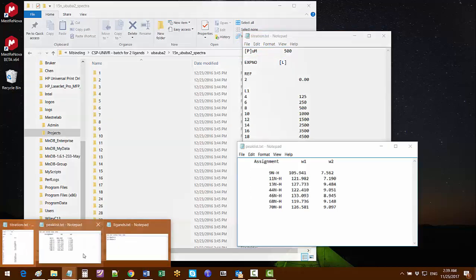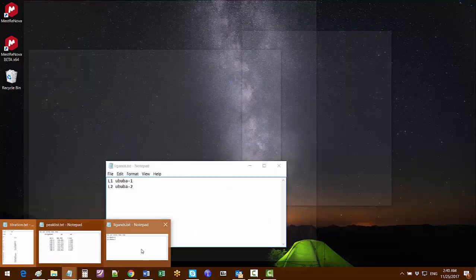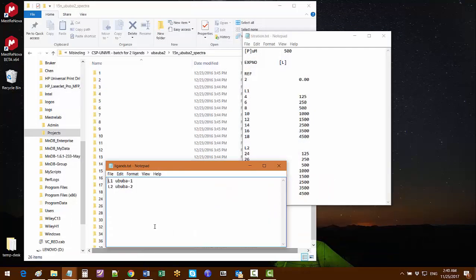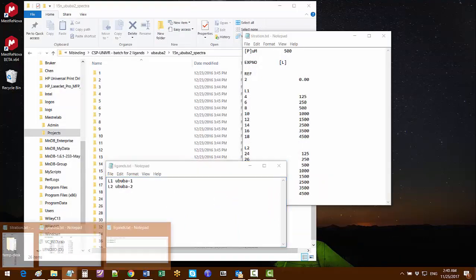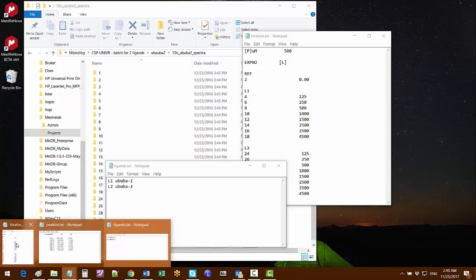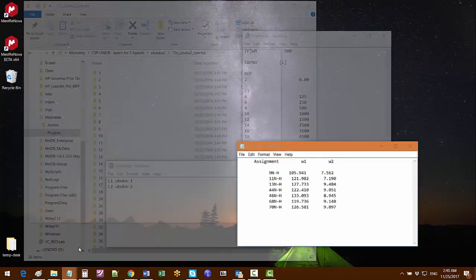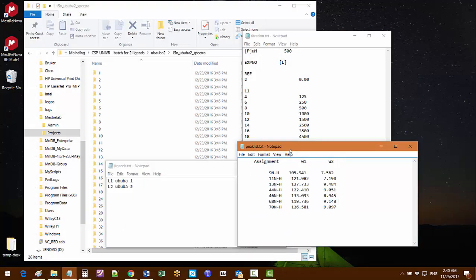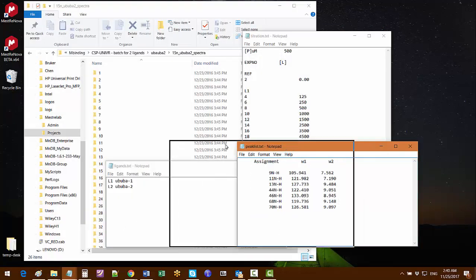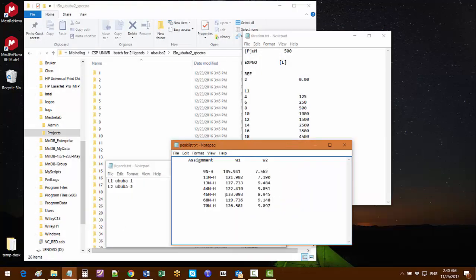In the ligands text file listed are the names of each of the two ligands. In the peaks text file we have the assigned peaks from the protein-only HSQC spectrum for which we are going to track the chemical shift changes and compute the KDs.